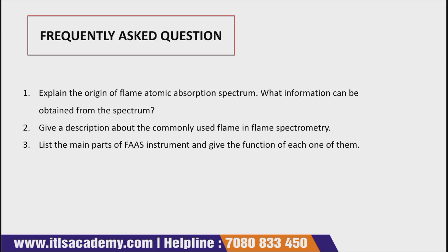Now comes the end part of the lecture, the frequently asked questions. This part is very important. The first question is: explain the origin of the flame atomic absorption spectrum. What information can be obtained from the spectrum?